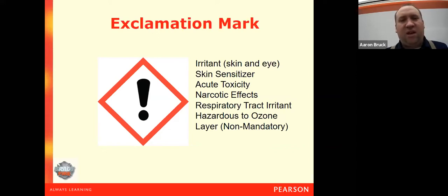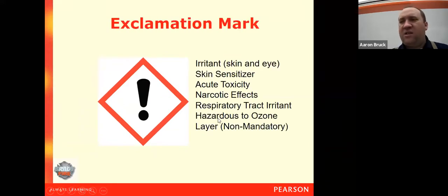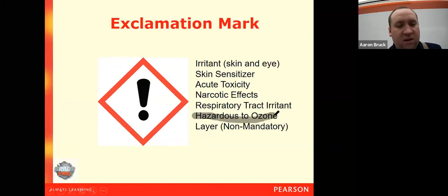So not quite the same thing as what we saw in the previous, where we had a respiratory sensitizer that would cause severe damage to your lungs and your other parts of your respiratory system. But things that would cause irritation, cause burning sensations, possibly cause bigger damages if the exposure was prolonged, and things that are hazardous to the ozone layer. And again, this last one is not a requirement here in the United States, but this could be used to indicate that hazard as well.